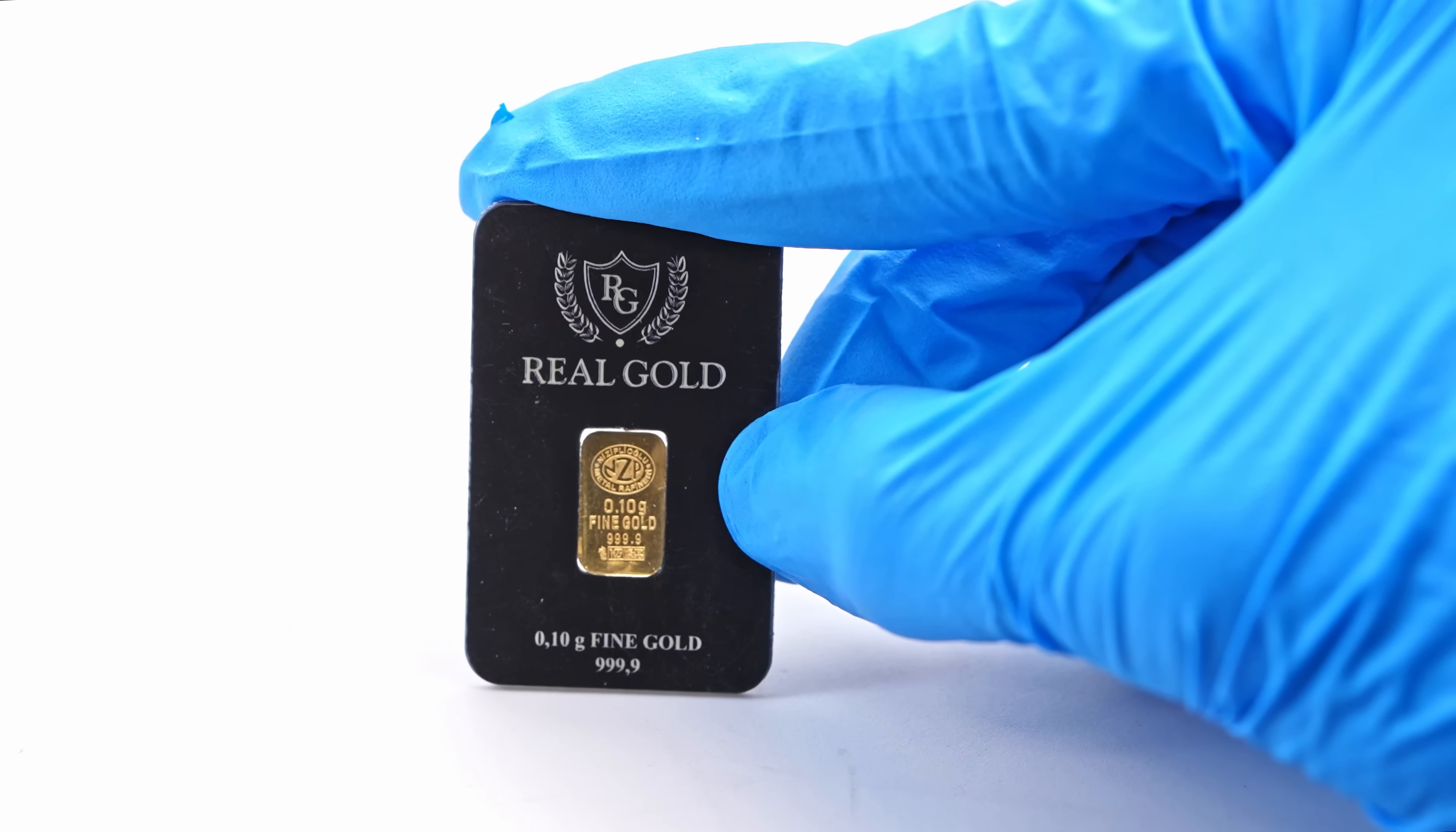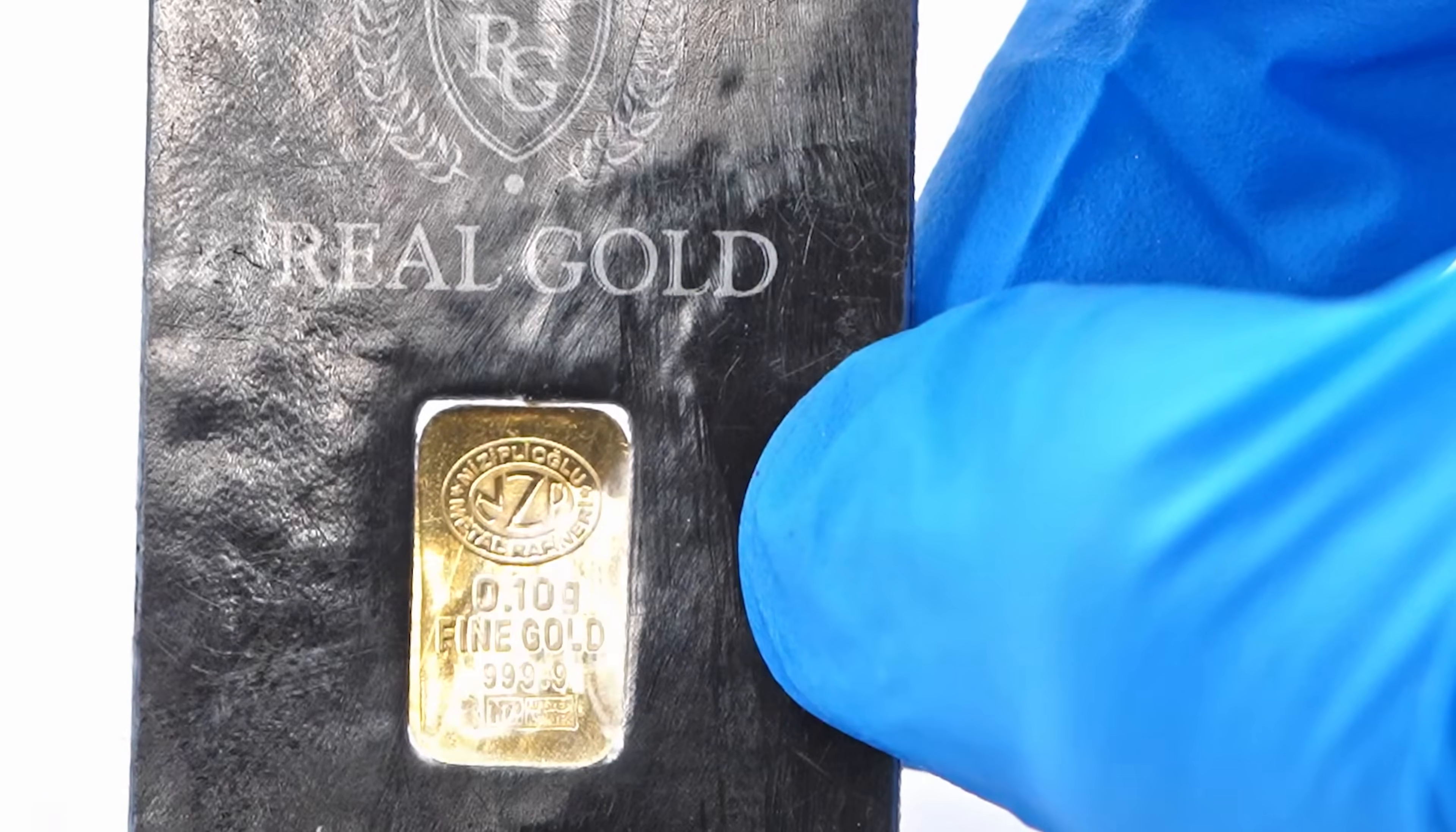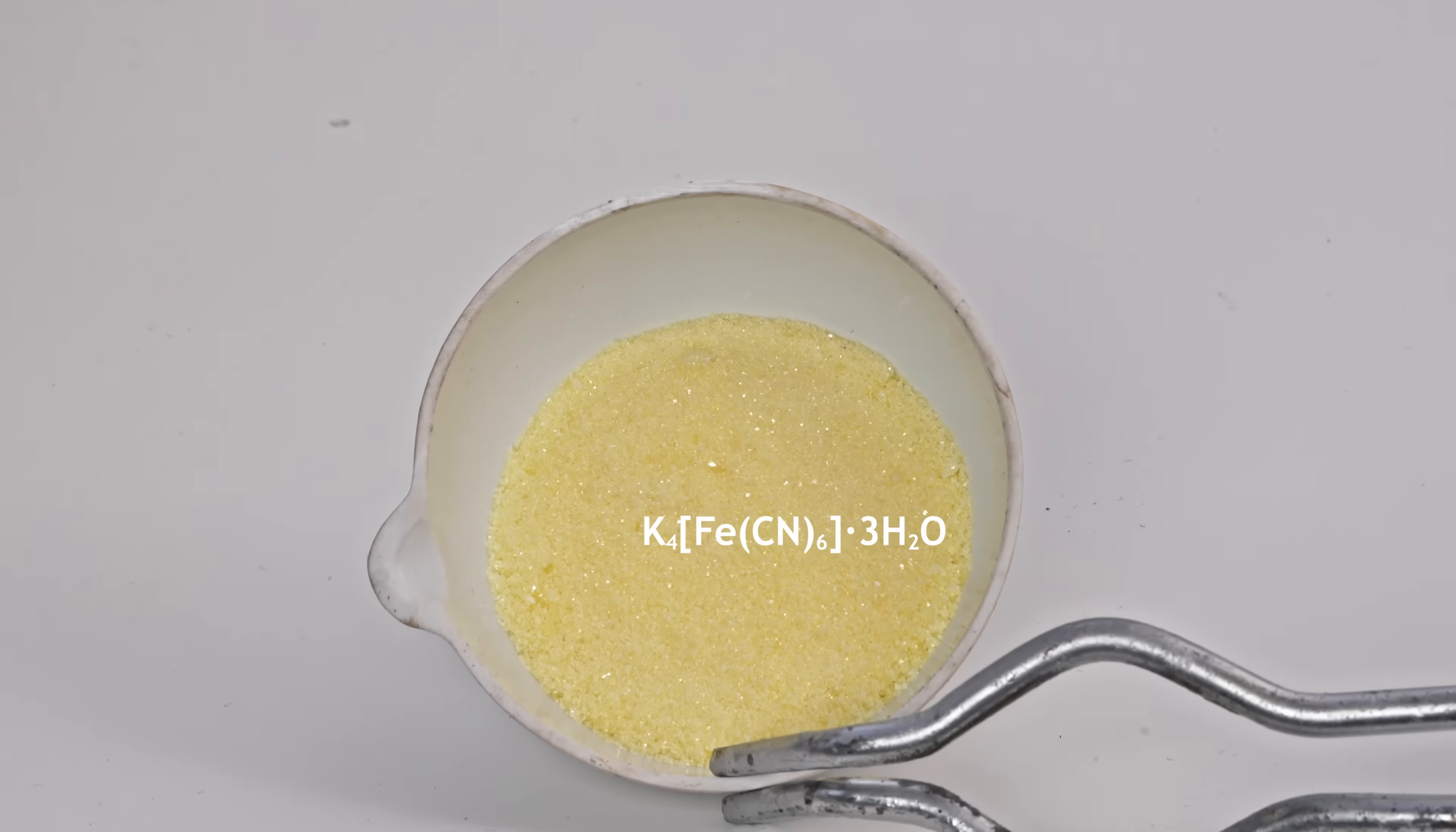Hey guys! In today's experiment, we'll try to dissolve this gold ingot in a solution of potassium cyanide. To start, I'll be making potassium cyanide from dry potassium ferrocyanide.